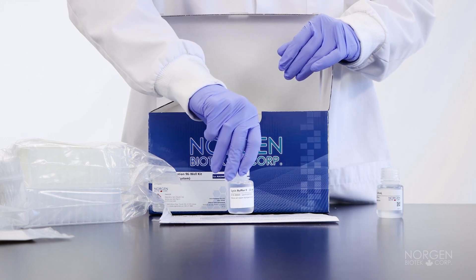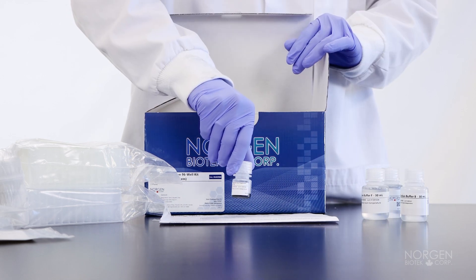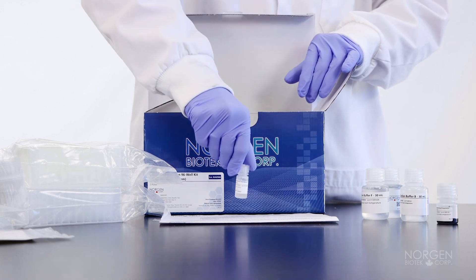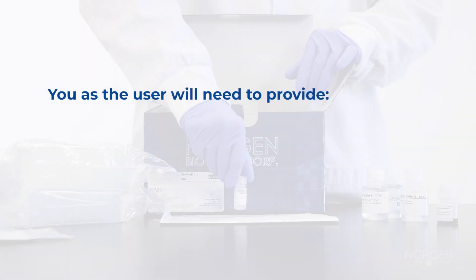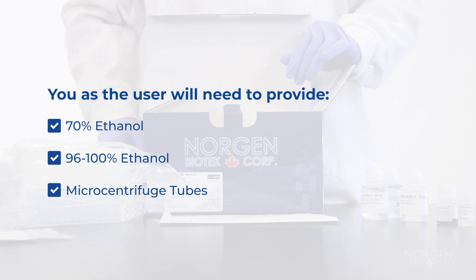The kit also includes two bottles of lysis buffer F, elution buffer B, magnetic bead suspension, and Proteinase K in storage buffer. You as the user will need to provide 70% ethanol, 96-100% ethanol, and microcentrifuge tubes.